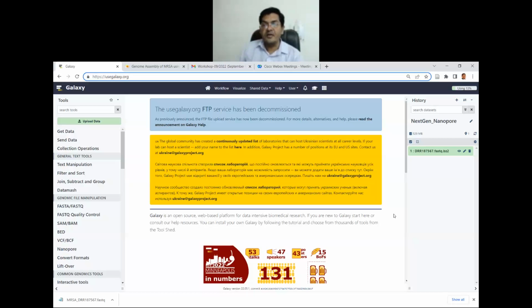Okay. Yes, sir. So let me take you very quickly through what we are going to do tomorrow. Before we close, excuse me, sir, what kind of data can we upload? Any kind of data, like a Word or Notepad file? No. This one is a .fastq file, and this is a compressed file. A Word document you can definitely not upload. When you're doing programming, a Word file is not something that we work with. It will always be a .txt file, the Notepad file. Most of these would be okay.